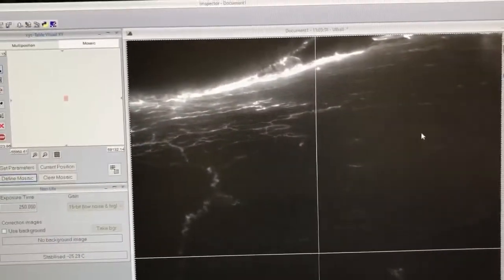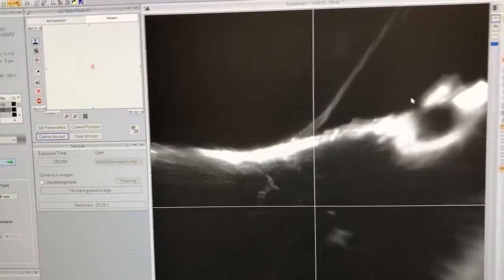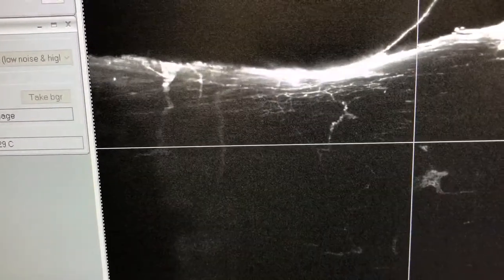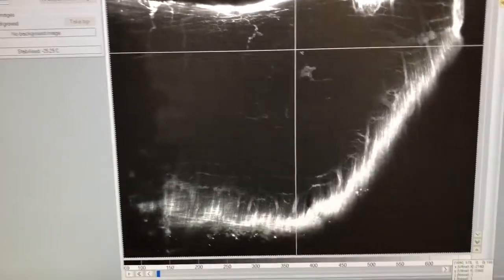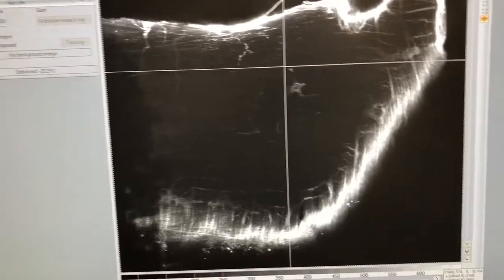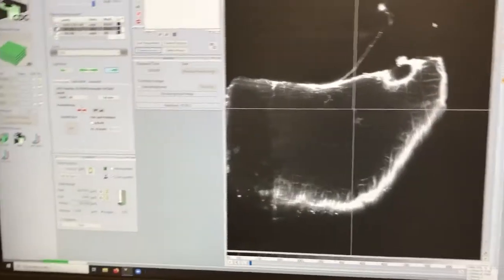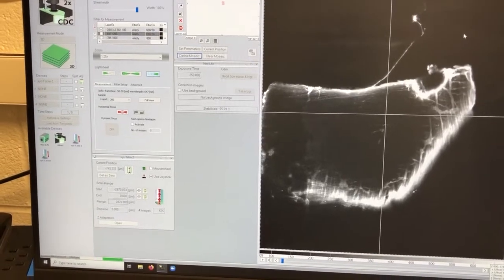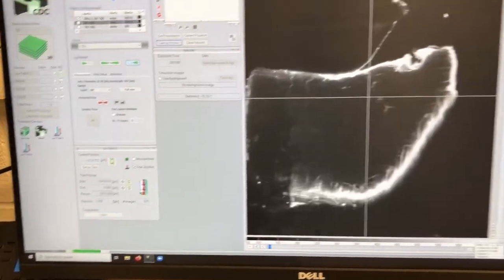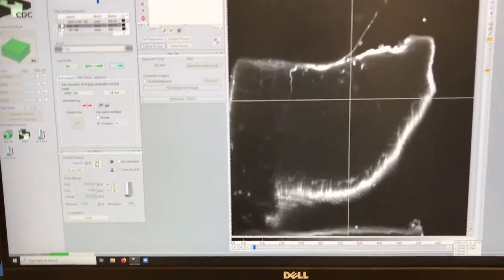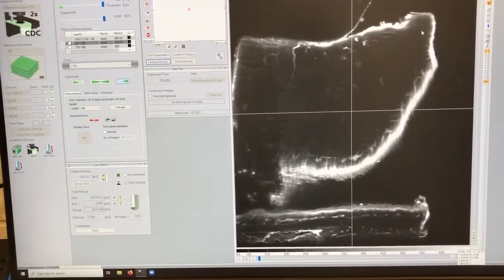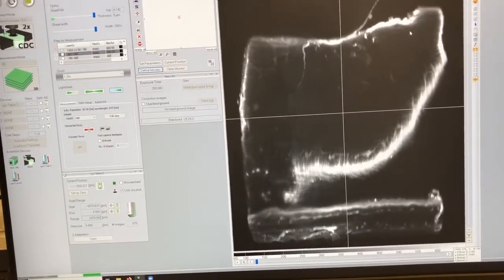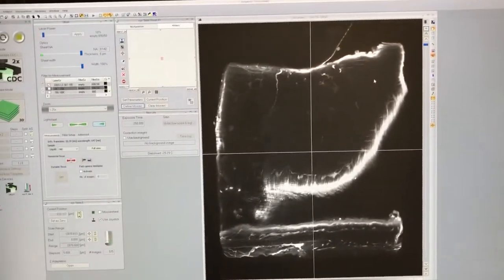Compared to zooming out, that's the highest possible detail. Zooming back out — what happens on this system is that people frequently overestimate the resolution they need. You can actually get a lot done with a relatively low zoom. I encourage you to at least start by taking low zoom images. I just wanted to show you some other zoom options and how they provide more detail as you would expect.